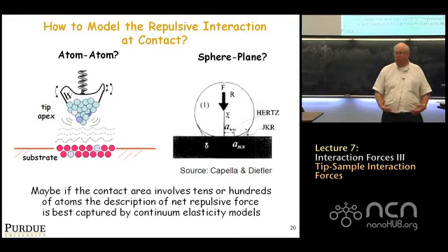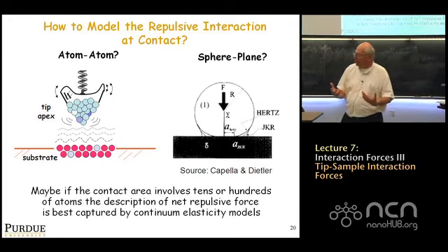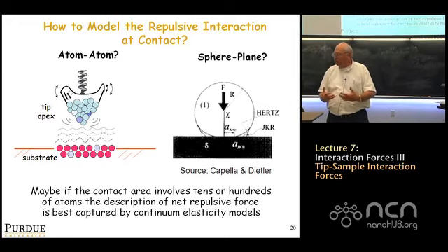So you don't have to write computer programs to interpret your data using these models. You can actually use the mathematical models that are already in the Veda software to try to explain the lift-off forces, let's say, that you measure experimentally between the tip and the substrate. There's going to be about 2 or 3 lectures just on Veda in the future in this course, and so we'll get into that in much more detail.